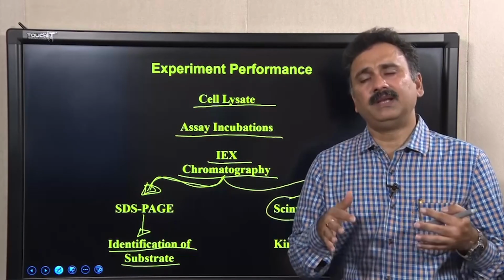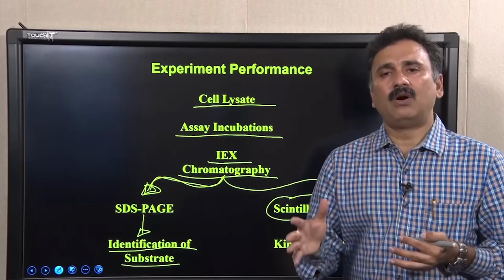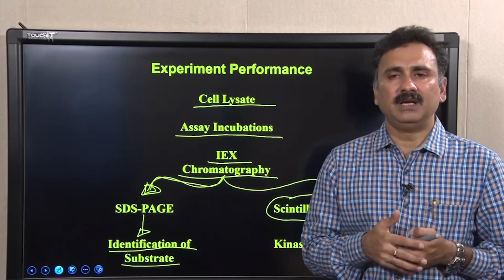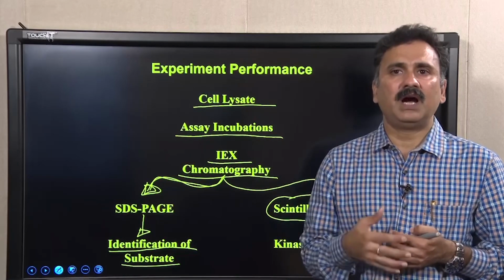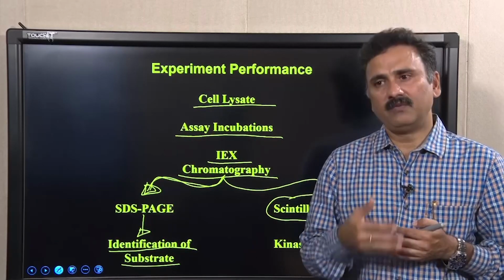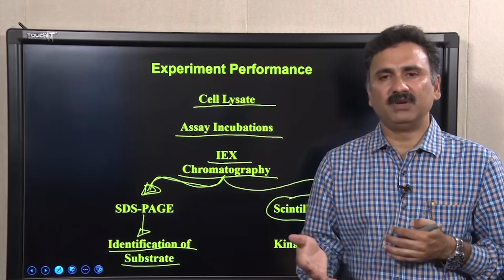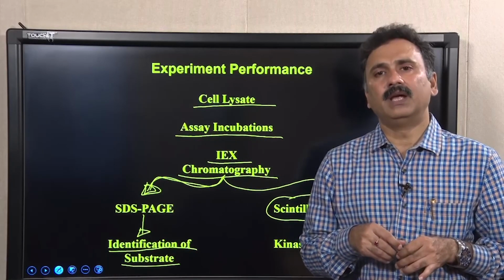In today's lecture we have also discussed the potential of ion exchange chromatography in solving different types of problems, and how you can use it to purify a protein from a complex mixture. So, with this I would like to conclude our lecture here.